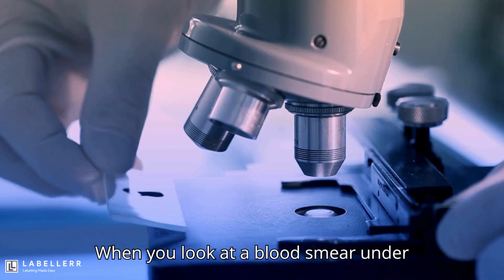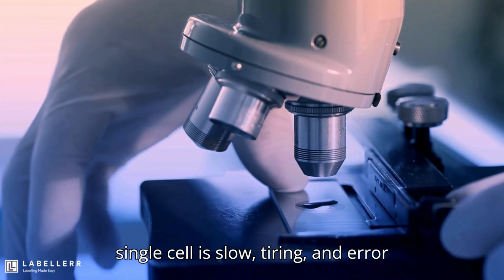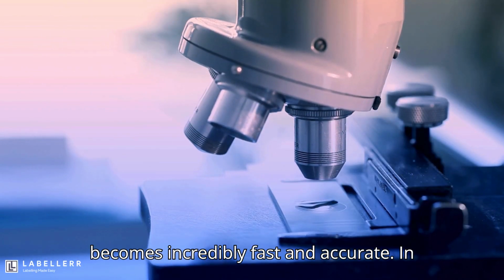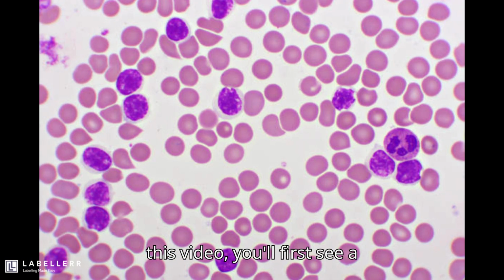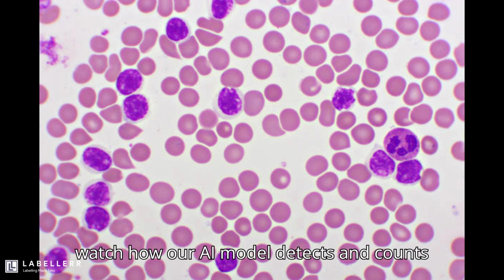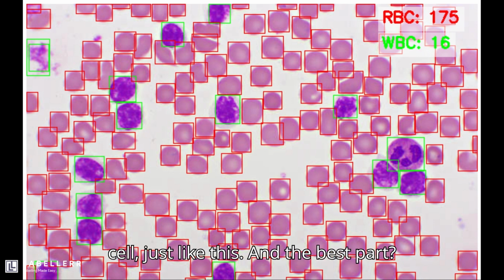When you look at a blood smear under a microscope, manually counting every single cell is slow, tiring, and error-prone. But with computer vision, this becomes incredibly fast and accurate. In this video, you'll first see a microscopic view of real blood, and then watch how our AI model detects and counts every red blood cell and white blood cell, just like this.